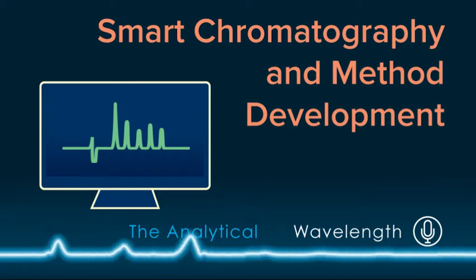or trying a couple of different mobile phase mixtures and then having the conversation about switching to a gradient, which could easily use a whole 3-hour class period, laboratory period, my plan is to spend a little time investigating that space and seeing what they're going to be, so that they'll know what they're looking for. Then during that 3-hour lab time that we have, we can use that time a lot more efficiently.